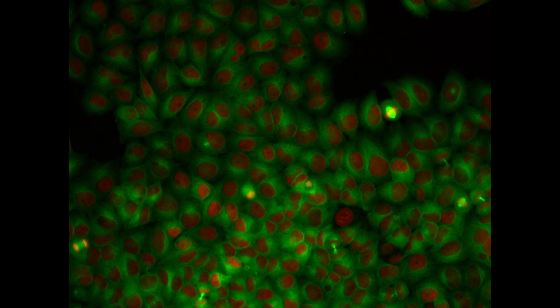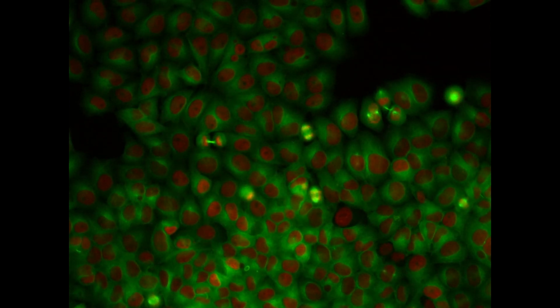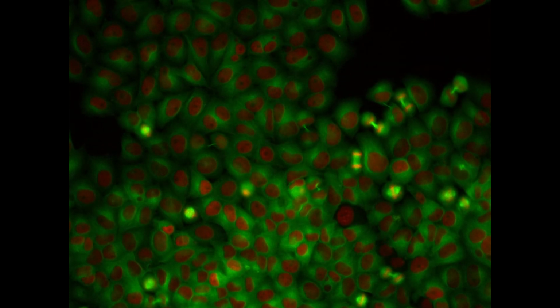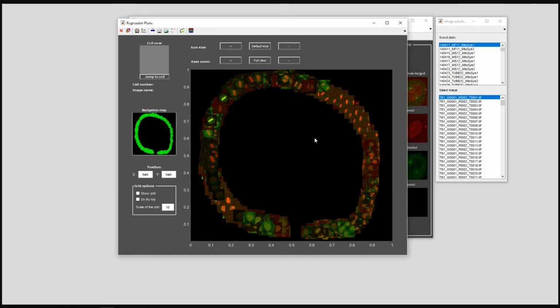Finally, in case your dataset is a sequence of images of the same cells acquired at different time points, for example live cell imaging, there is also an opportunity to visualize their dynamics, meant as the change of their positions over time. Trajectory plot is the module to generate a trajectory for each cell, showing the xy position of the same cell in the regression plane at different time points.